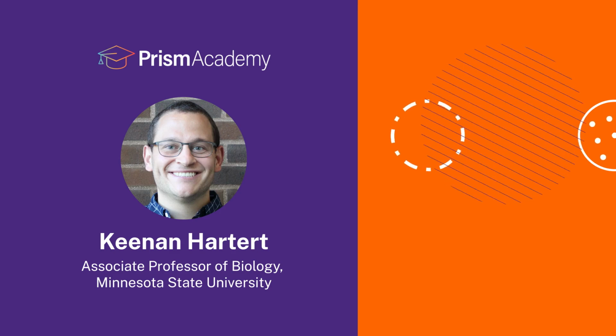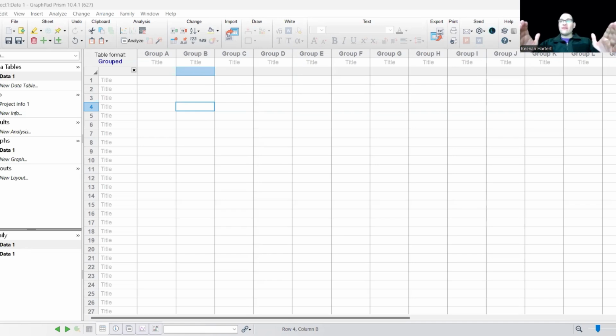Today, I'm going to show you some of the features that Prism has for graphing heat maps, especially if you just want to do standard heat maps or you want to convert from a matrix form into more of a response summary variable form. And we'll show you how to use multiple variables format to give that a shot.